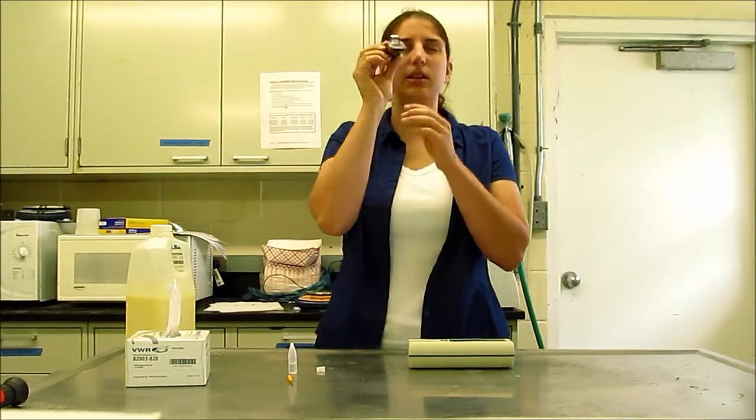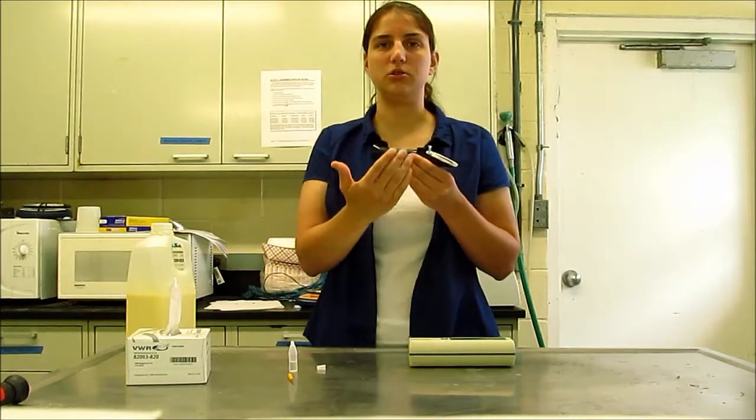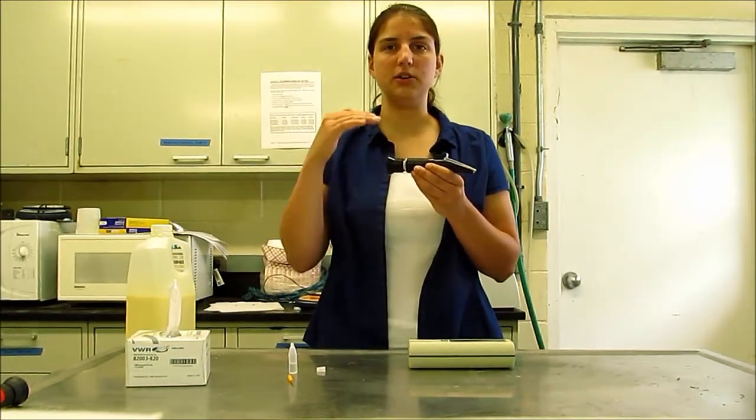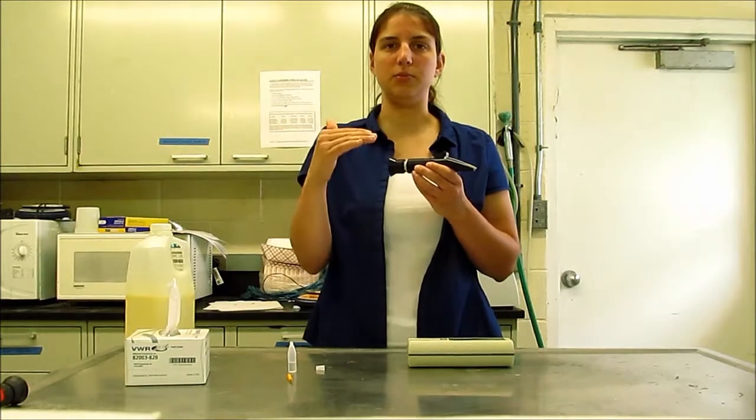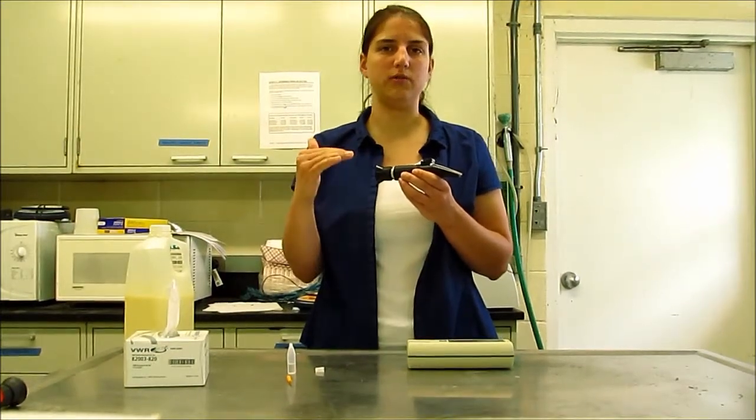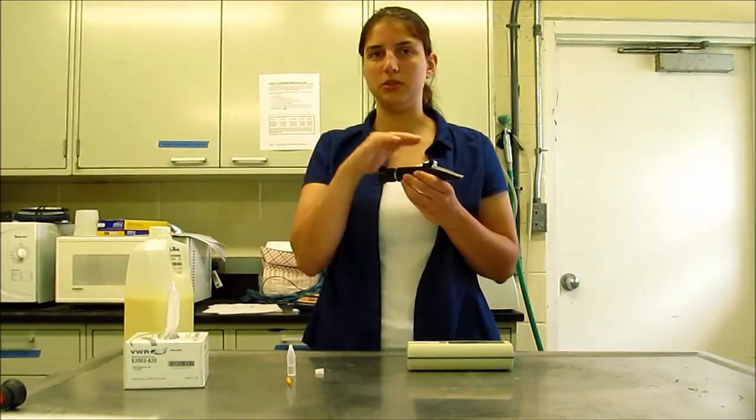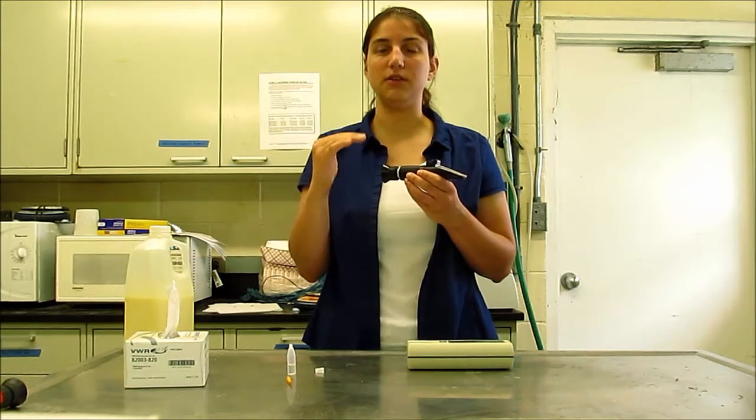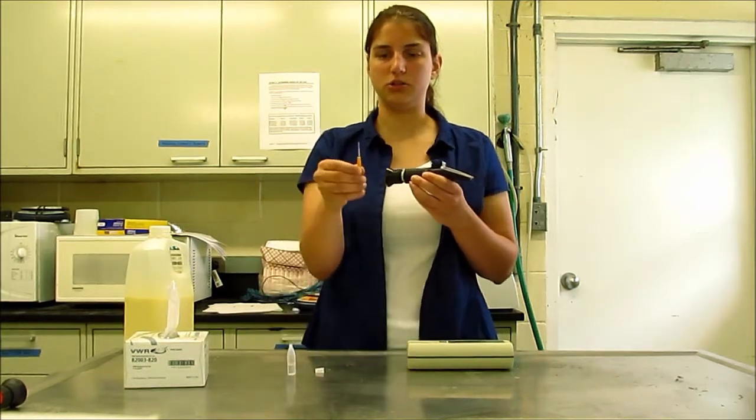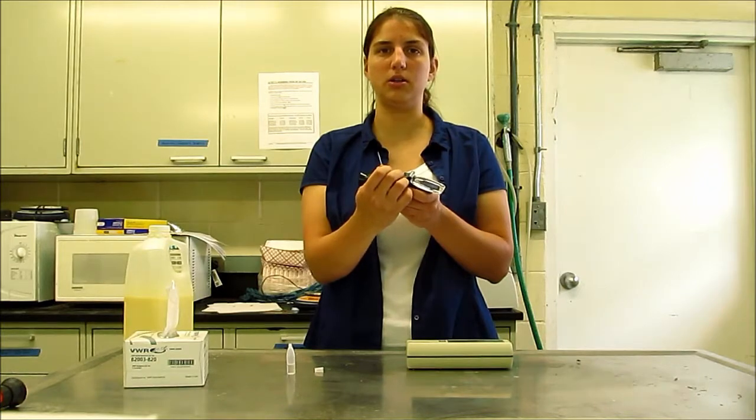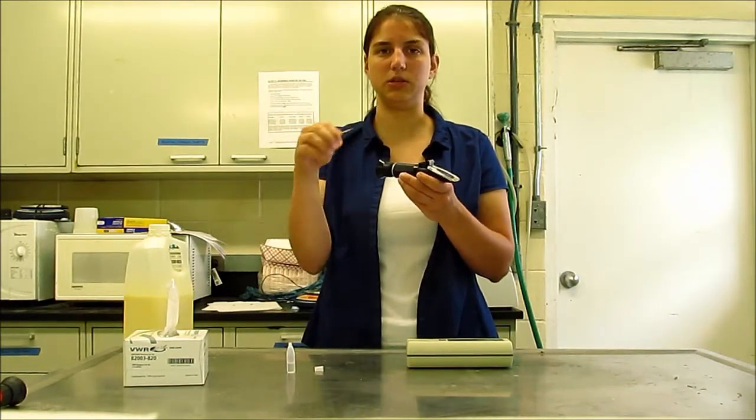You'll want to do this in an area that is well-lit so that you can clearly see. What you're looking for is the interface between a blue region and a clear or white region, and that line between those two colors should be right at zero. If not, use a small screwdriver and turn the screw one way or the other to adjust that line to be at zero.